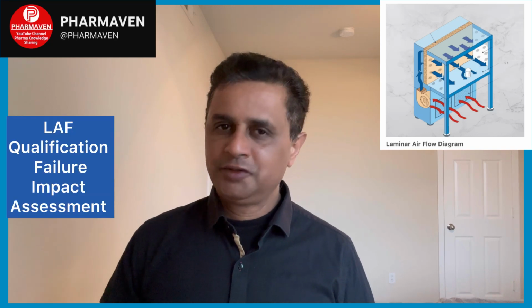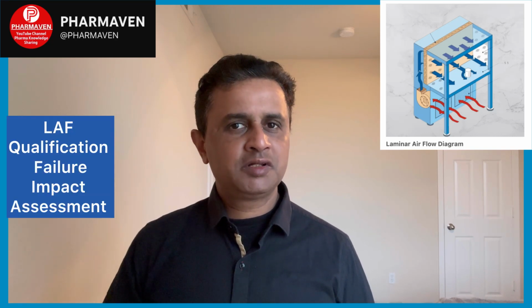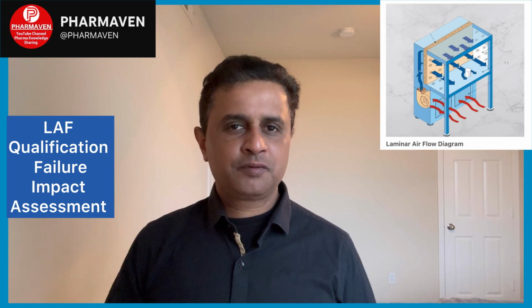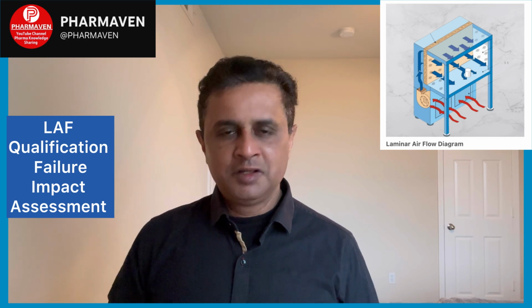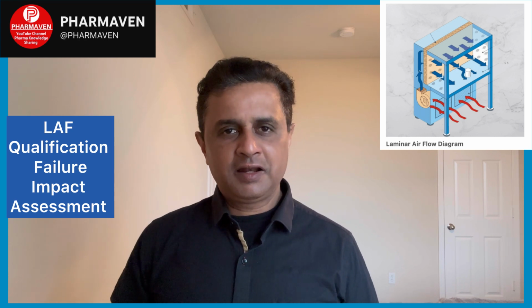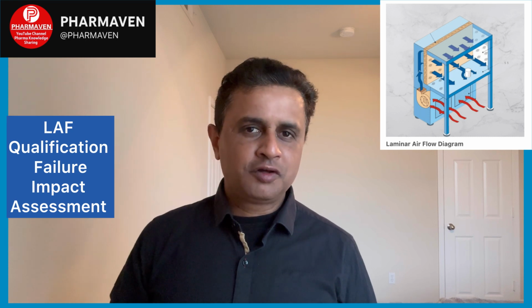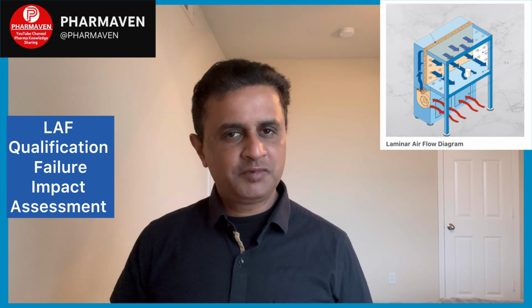Hi, in today's video, we will understand the impact assessment to be done when there is a failure in laminar airflow filter integrity testing. So once there is a failure in your LAF filter integrity testing during scheduled requalification, how do you perform an impact assessment of that failure?